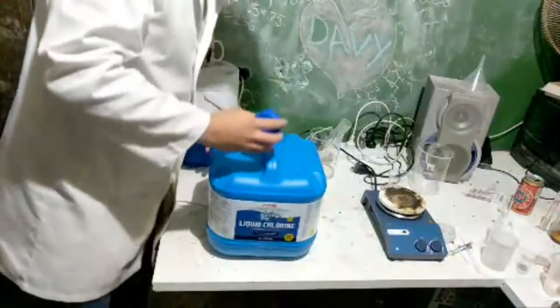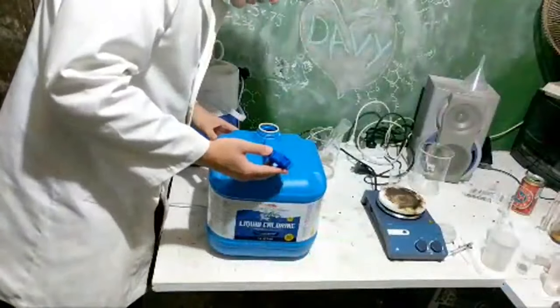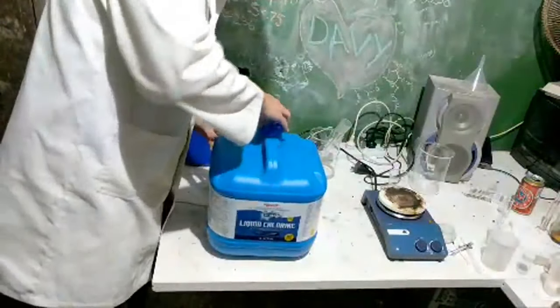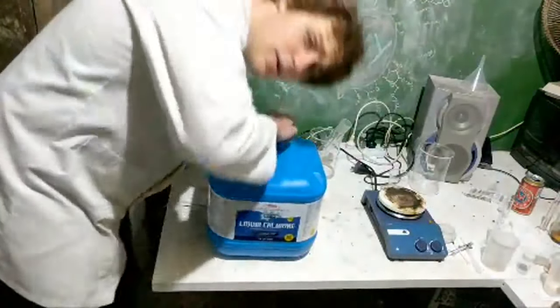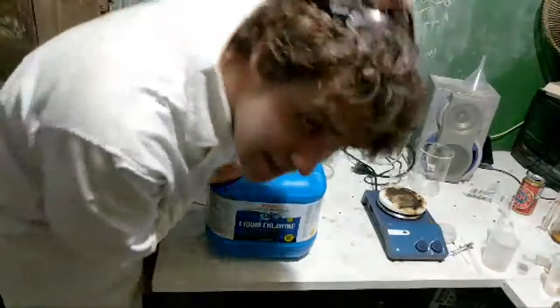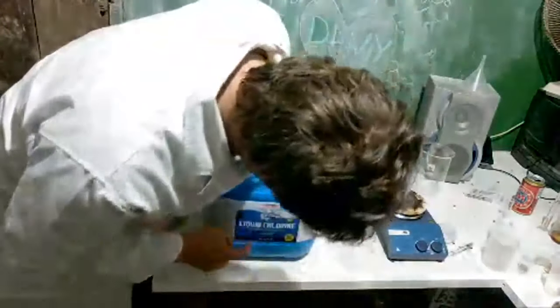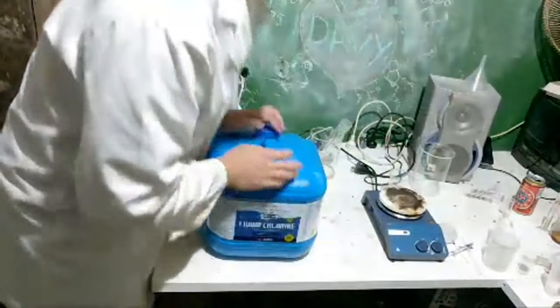So, there's a lot of it. Well, probably half full, maybe less. So there's probably 5 or so litres of this bleach of unknown concentration. I'm keen to use this. I think it would be good to make some ferrates with. I wish it was a bit more concentrated, but can't have everything.